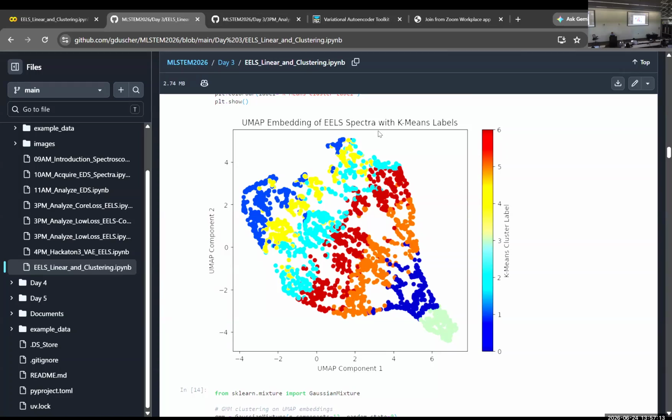So basically what you see in this type of graphs is that once you have spectra, you can get labels from one method, for example, k-means clustering, but represent them using different methods, for example, t-SNE. And then you can use the k-means clustering to color the distribution in the t-SNE or PCA space. The practical usefulness of this approach is not zero, but you need to be very careful about what type of questions you ask.